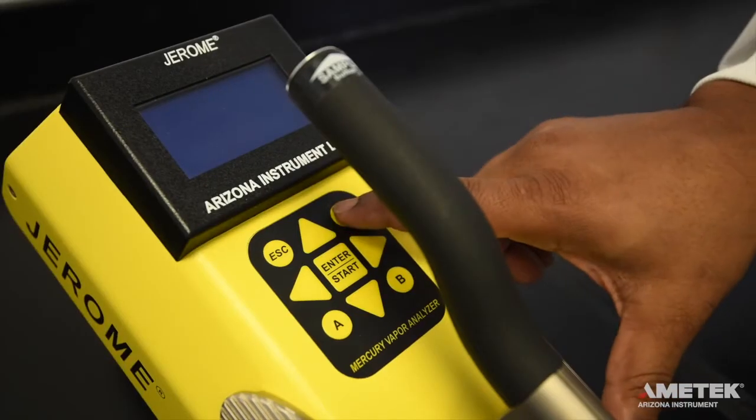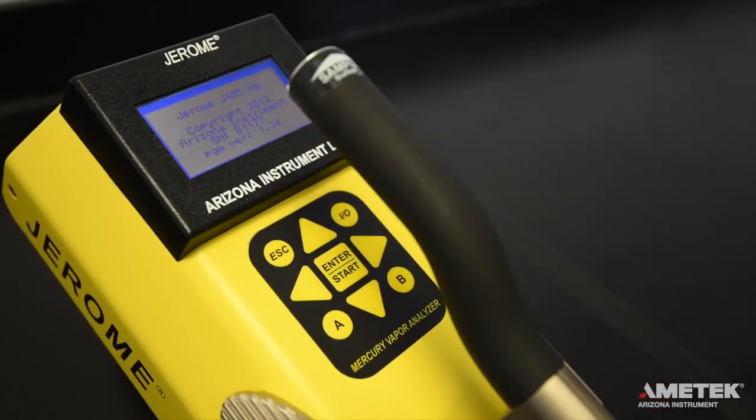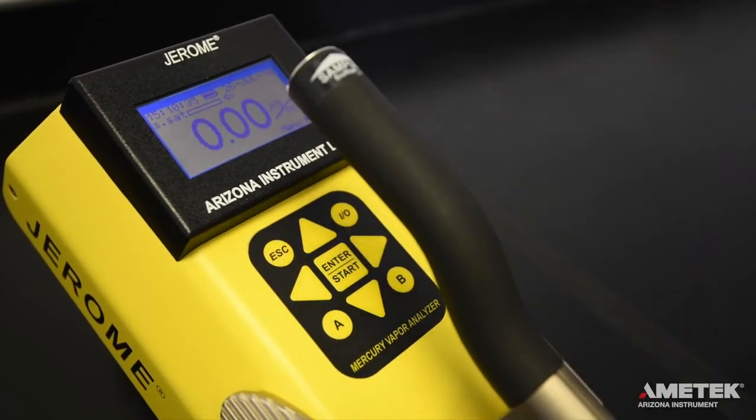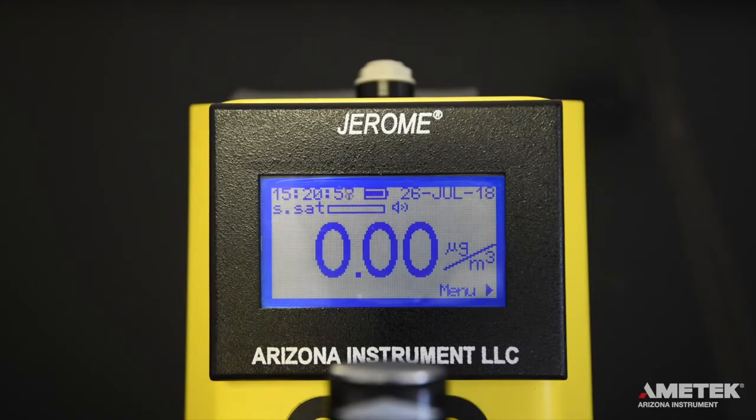After you have verified that you've received everything on your packing slip, simply turn on the instrument by pressing the power button. If any calibration reminders appear, simply press the escape button to return to the main screen. The display should read 0.00 micrograms per meter cubed. On the main menu screen, you will see the date, time, battery life indicator, test result, result units, sensor saturation meter, and menu link.